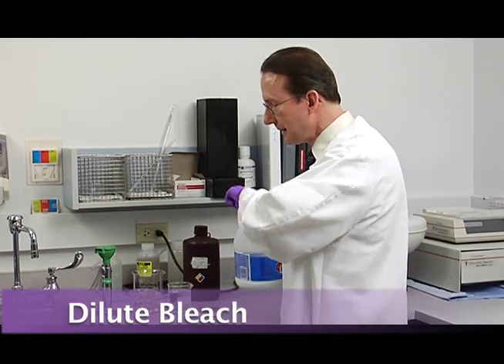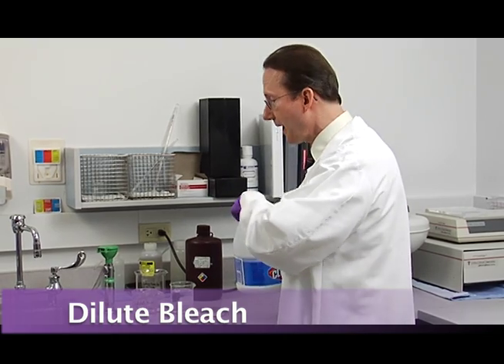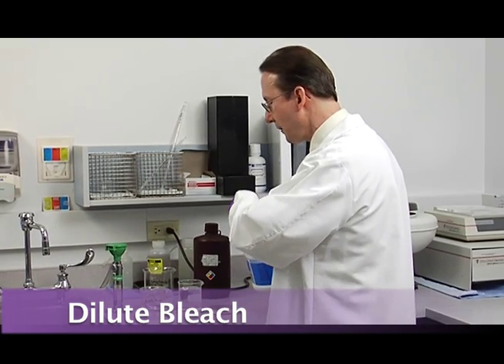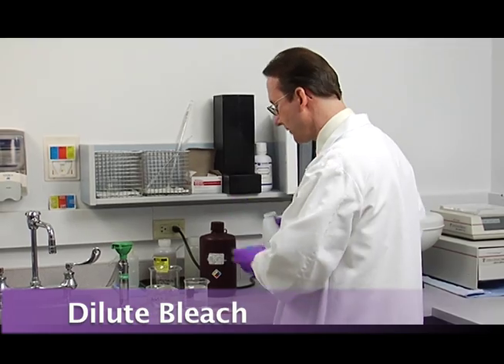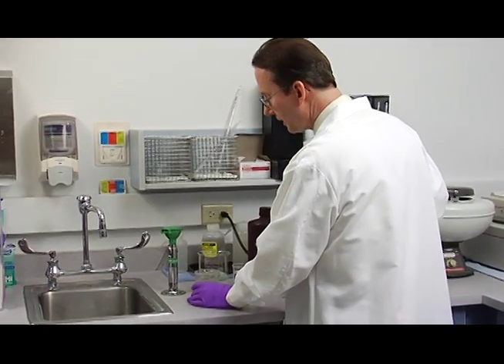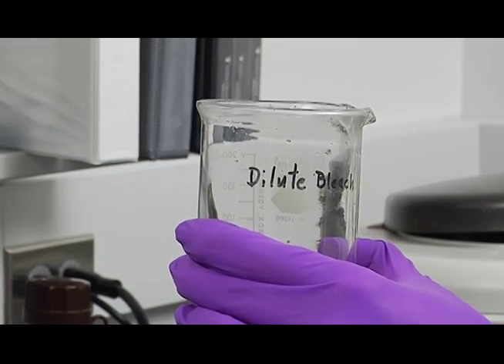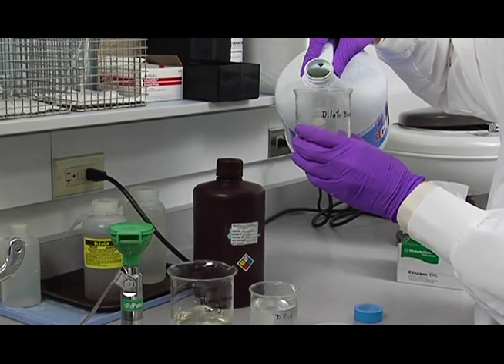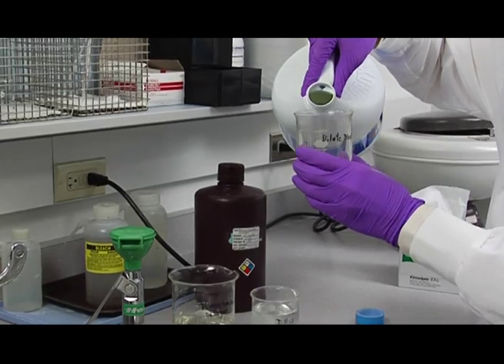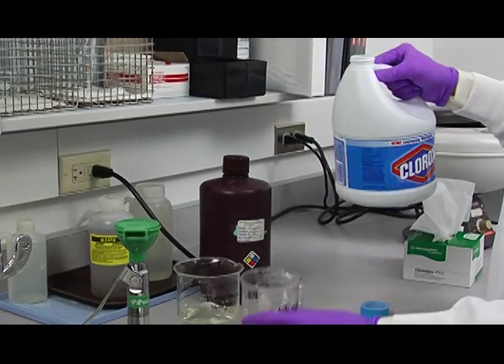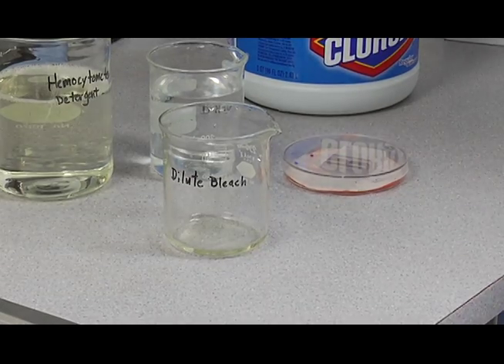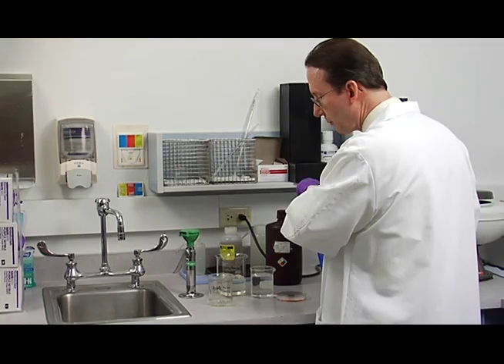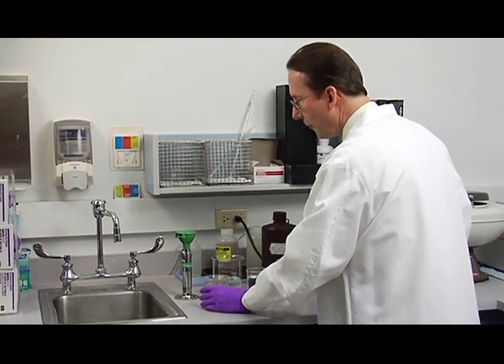The first solution is some dilute bleach to disinfect our hemocytometers when we're completed with our counts. To do that, just take your beaker. I've labeled it dilute bleach. We're just going to cover the bottom of the beaker with bleach, just enough to cover the bottom. And then we're going to fill up about three-quarters of the way with tap water.